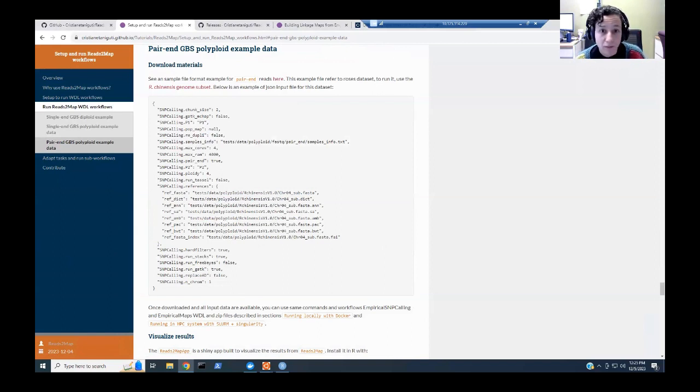And about the duplicates, for GBS, if you remove the duplicates, you lose all your data because all GBS reads are duplicates. So you would not have depth. I understand duplicates as sequences that start and end in the same position in the genome. So if you remove these and all GBS sample reads are like this, you will lose all your depth. In WGS, it is slightly different.